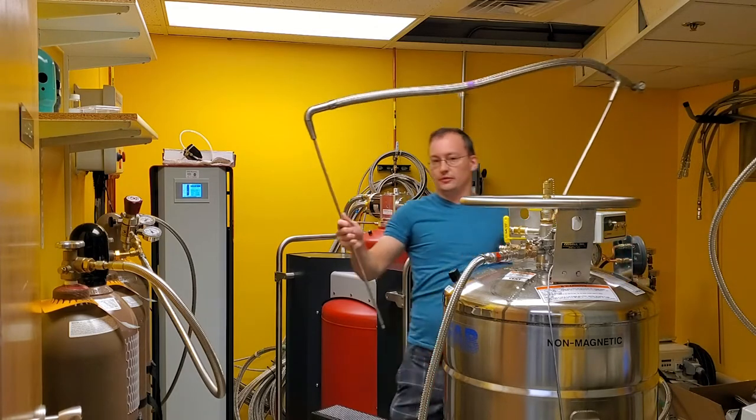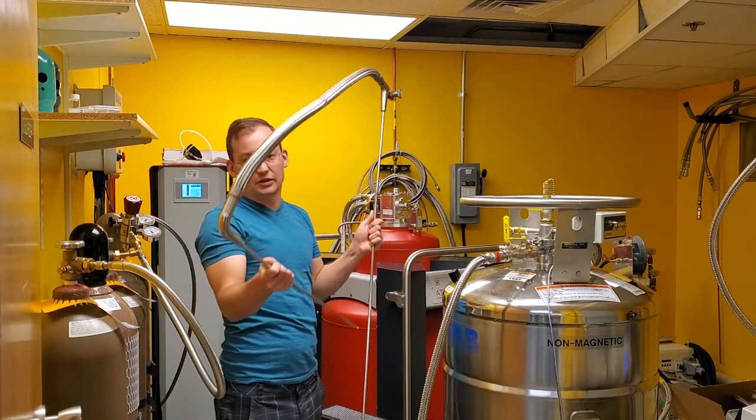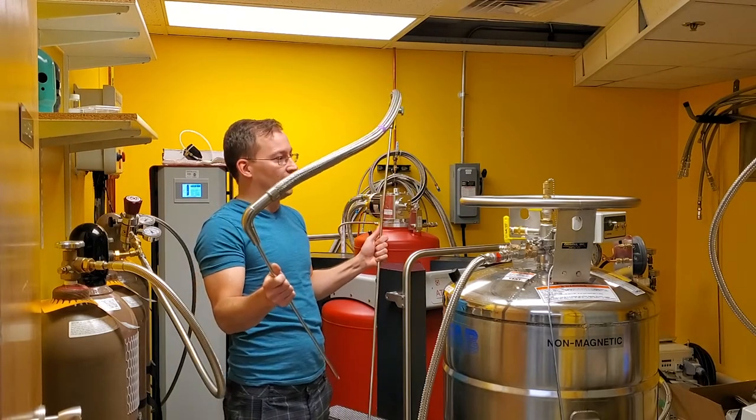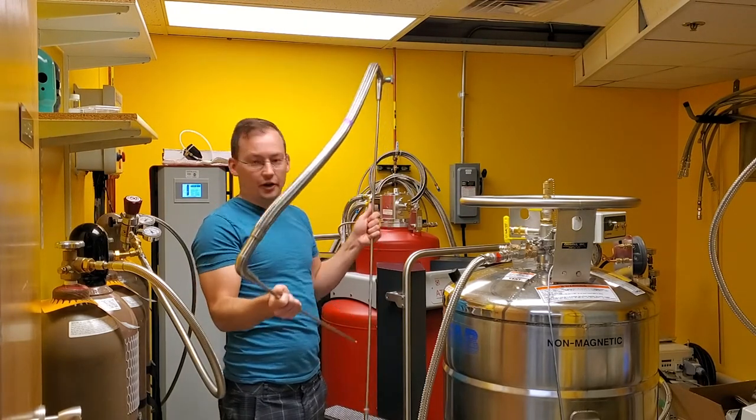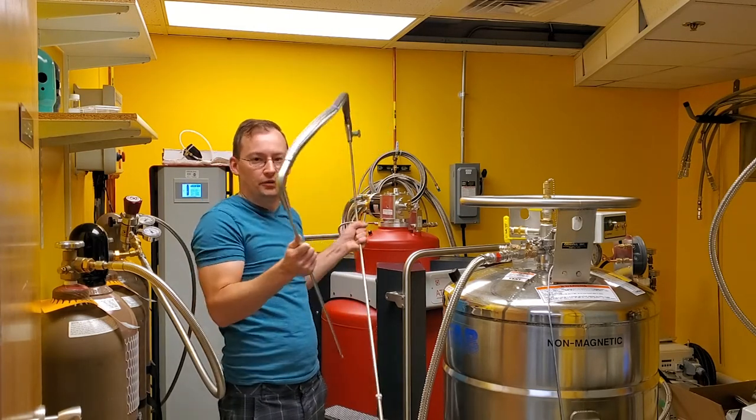The last component you'll need is the actual stinger — that's the transfer line that the helium will actually run down. I like to call it a harpoon, and I call the Dewar the whale — you're harpooning the whale.